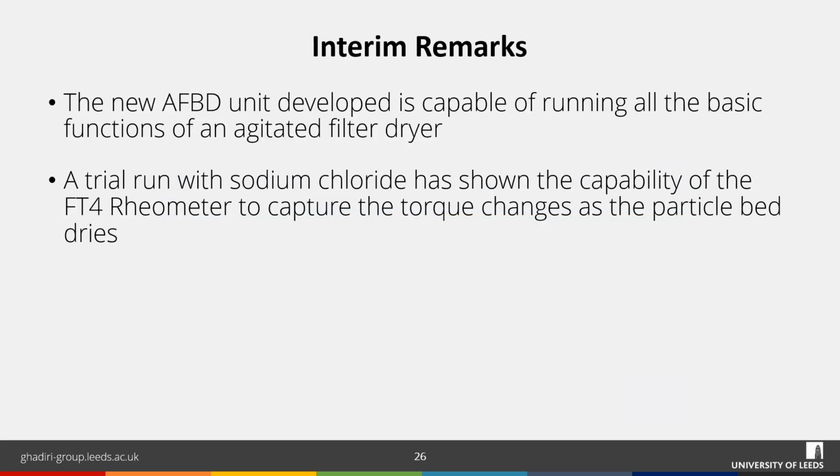Just some interim remarks here. I hope I have demonstrated to you that our new test rig is capable of running all the basic functions of an agitated filter bed dryer through the quick study with sodium chloride and IPA. You can see that the FT4 rheometer is able to capture the change in the powder bed as drying progresses in the new test rig.